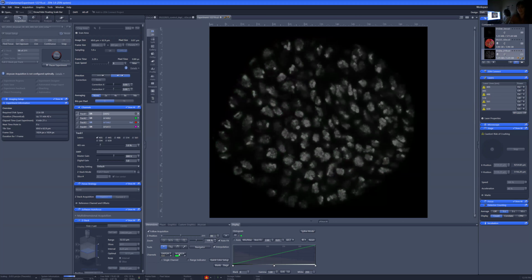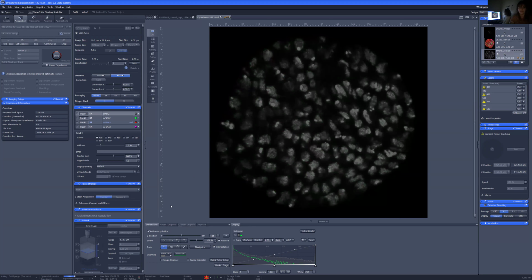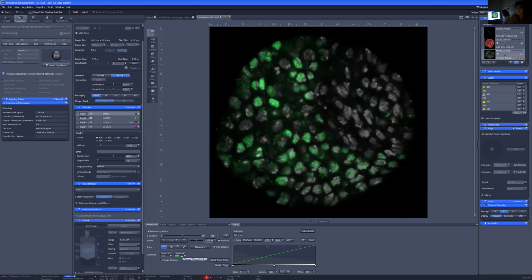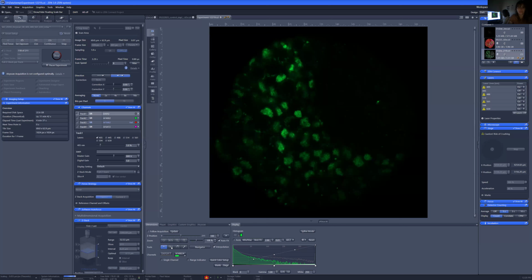Mikala, did you have anything that you want to update us on in terms of what you're looking at? No, things look good. My overlap between my two channels looks pretty good. Great. Let me see here.